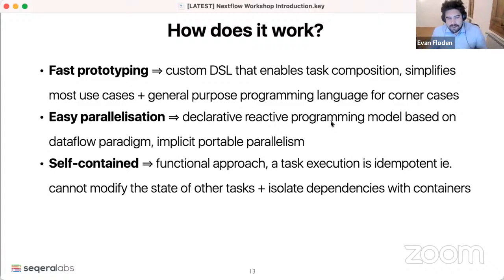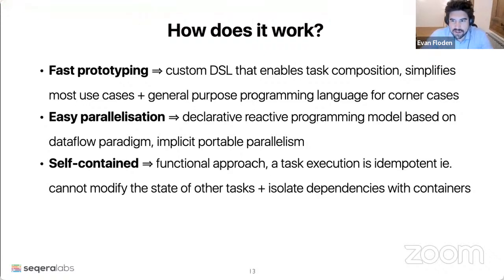Very early on, we made a decision to keep Nextflow as this concept where each task is self-contained. What that means in practice is that each task lives in its own working directory. It's essentially its own unit of compute in a way. And as part of that, it means that each task could very easily become containerized. And this was actually slightly before the use of containers, so it was an advantageous, or fortuitous, decision.